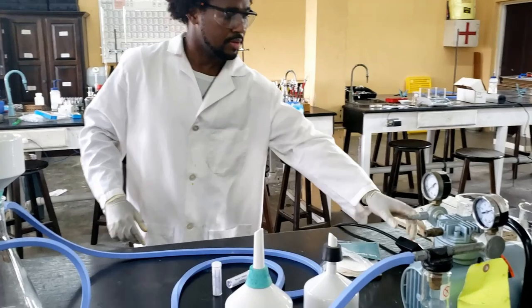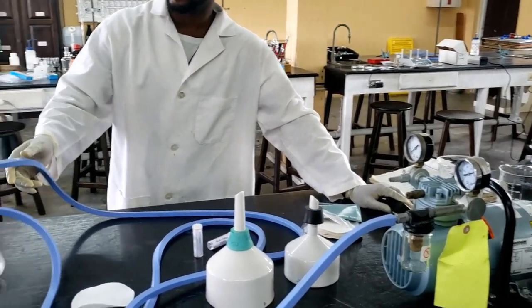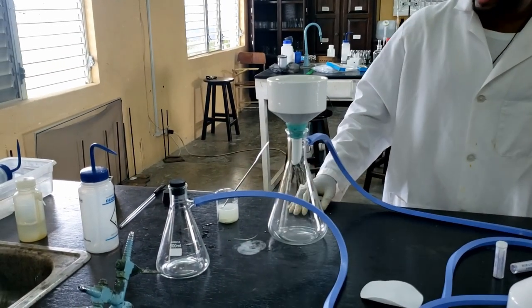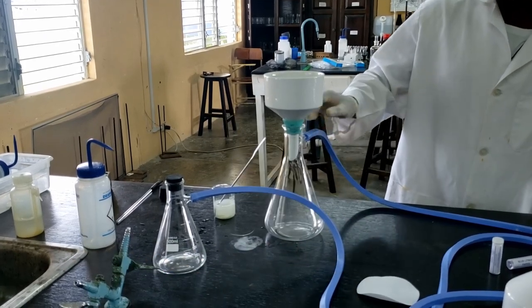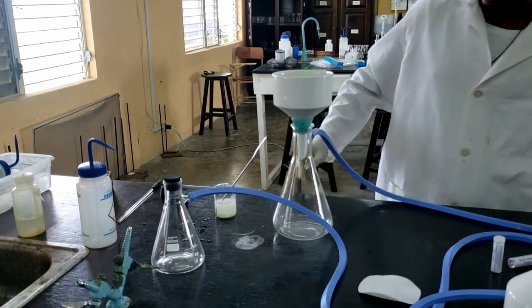Let's start the vacuum pump. Important, what I always warn students about is when you're vacuum filtering, you don't want to let the flask fill too high. If water gets inside the pump, it could spoil the vacuum. And when you're pouring out, you also want to pour away from the holes. So I'll turn it on.